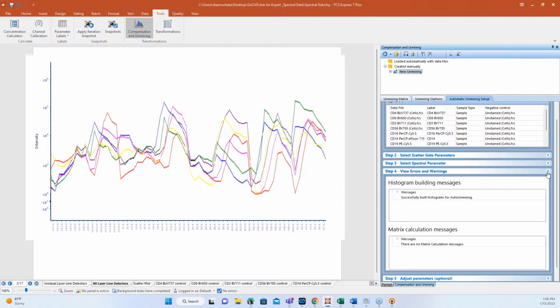So that's one of the things that you're going to see. But again, we offer a lot of information about what exactly is happening and where that error is. So it's really easy for you to unfold and figure out, oh okay, so I just need to fix this, go and look at my data and see if maybe for whatever reason the wrong channel was chosen and I need to update that.